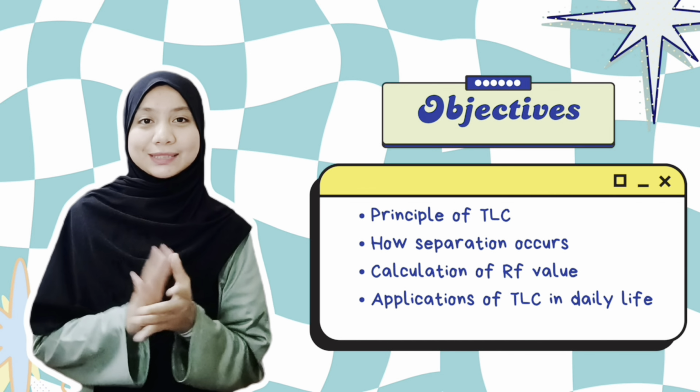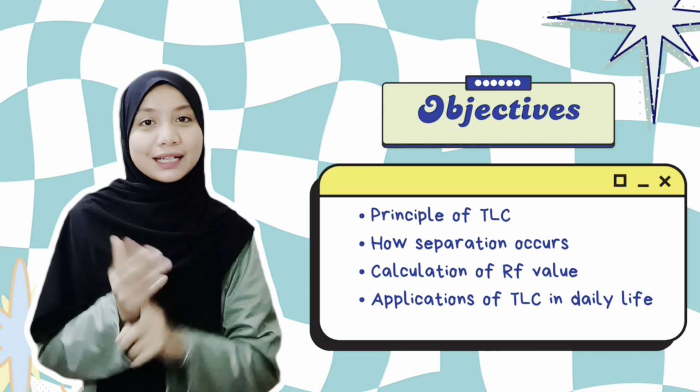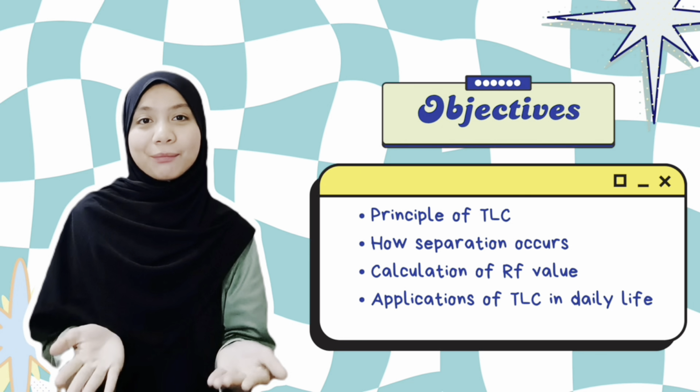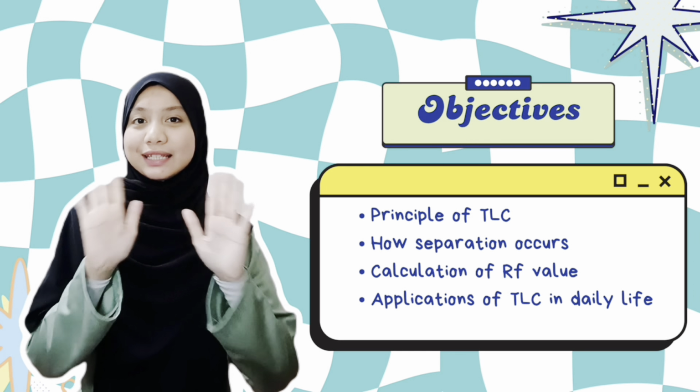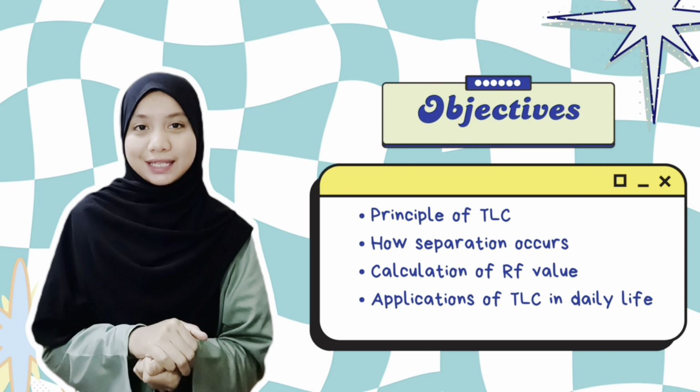In this video, we will explain the principle of TLC, how separation occurs, the calculation of RF value, and the application of TLC in daily life. First, let us understand the basic concept of TLC.